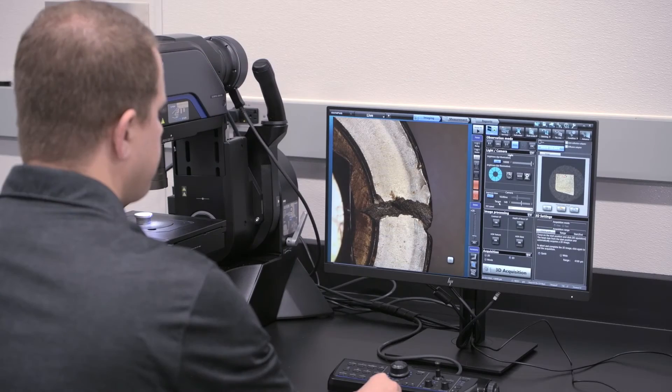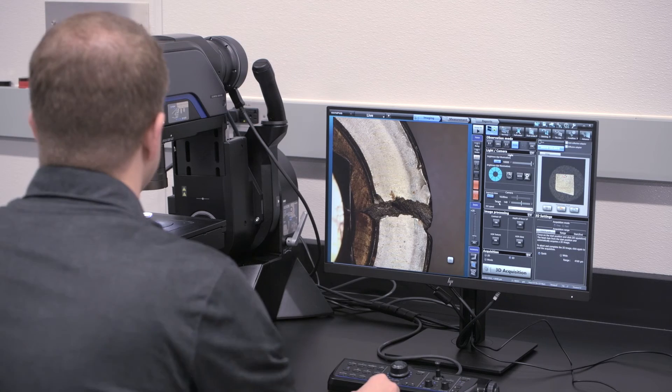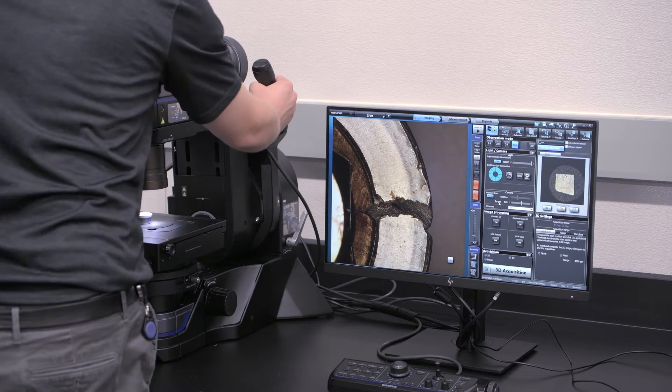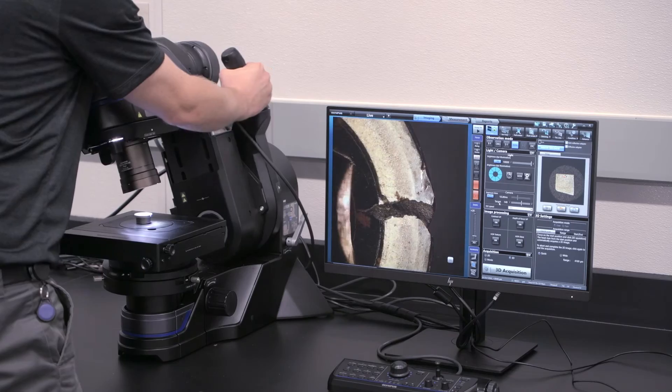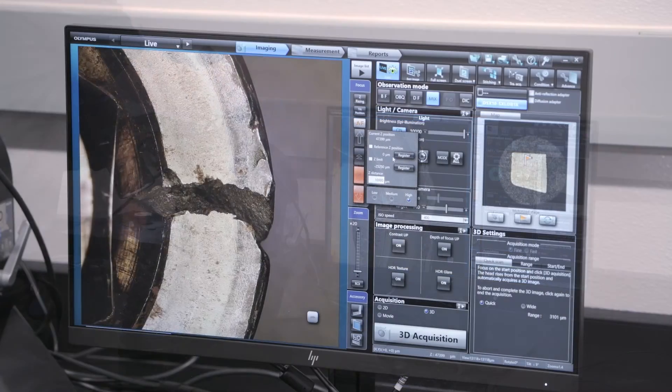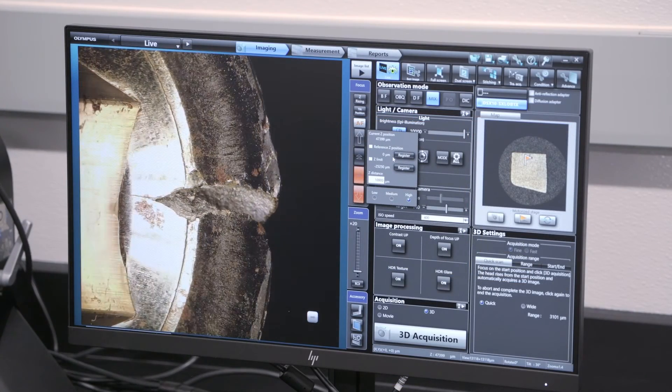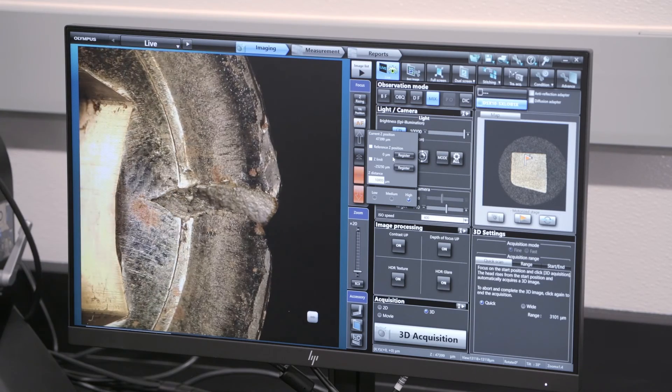With automated focusing, a motorized XY rotatable stage, and a 180-degree tilting head, observation and sampling position can be optimized for your needs.